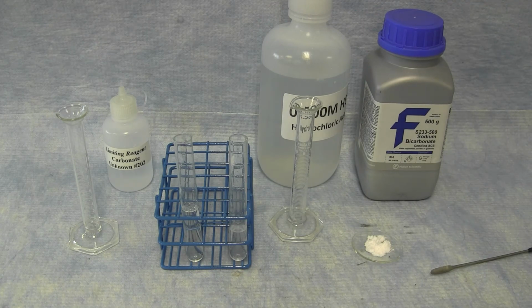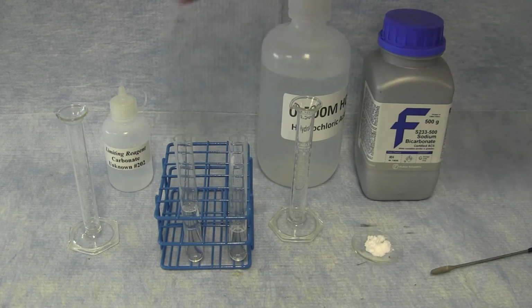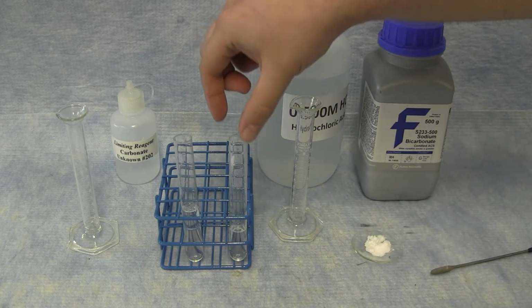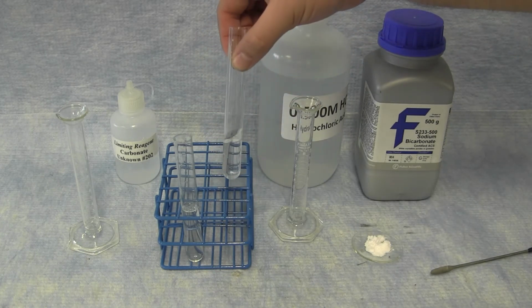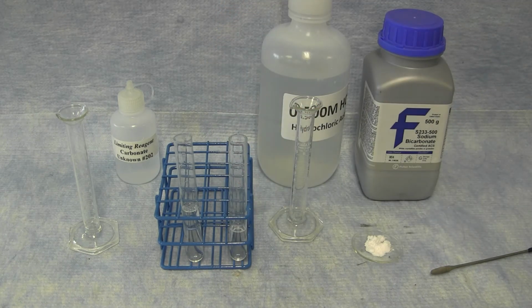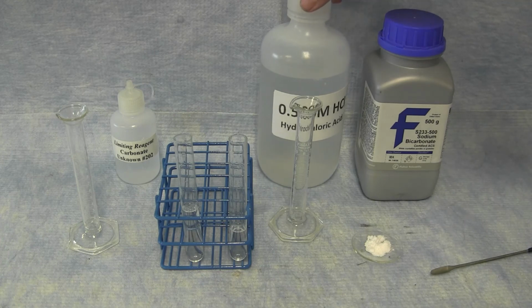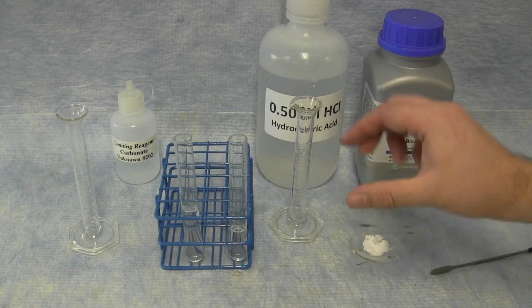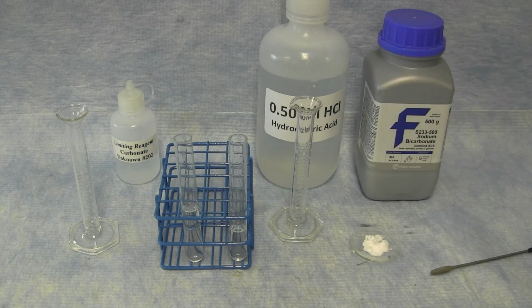You can use these observations to determine what is the limiting reactant in your unknown sample, that first set of reactions. From this setup, since carbonate still reacted, that means initially there was leftover hydrochloric acid. So the carbonate in this setup was the limiting reactant.